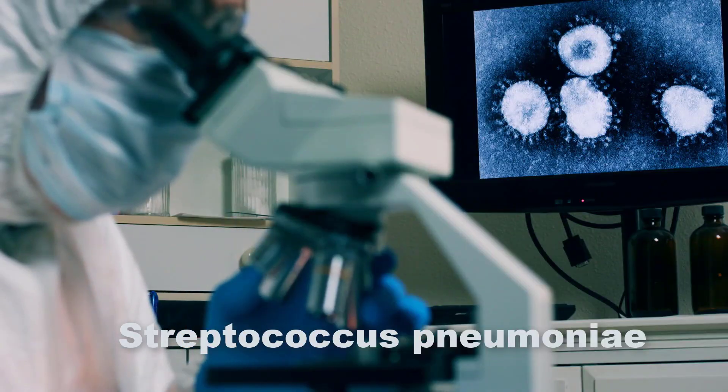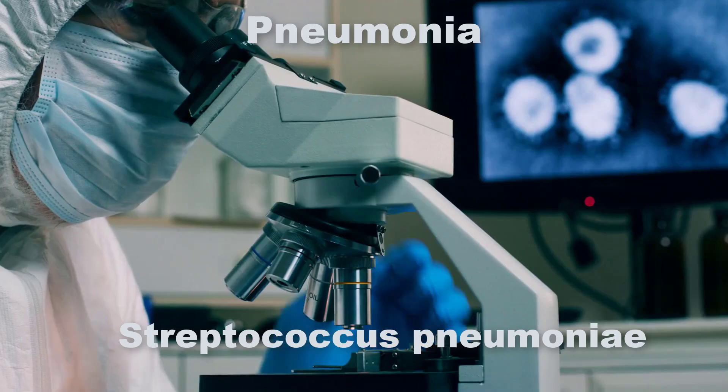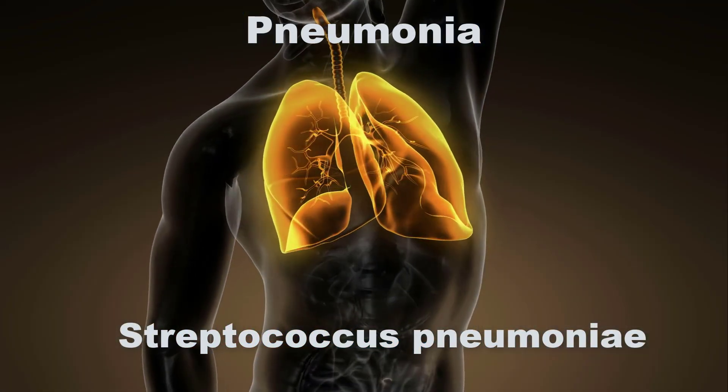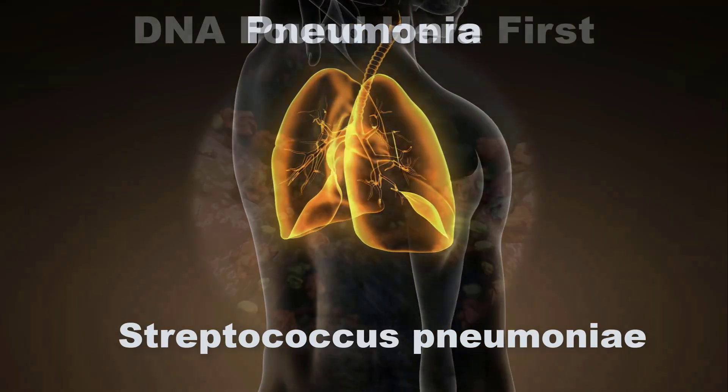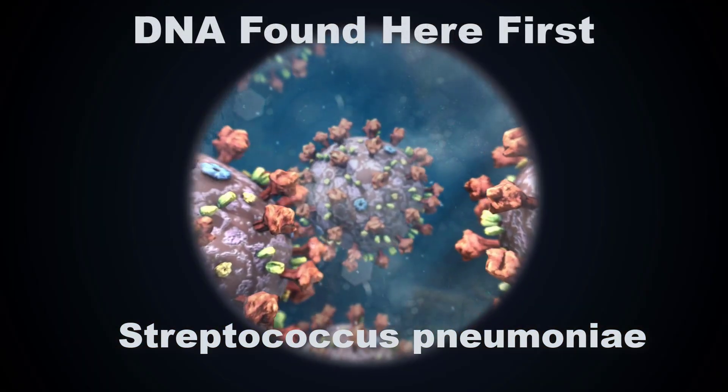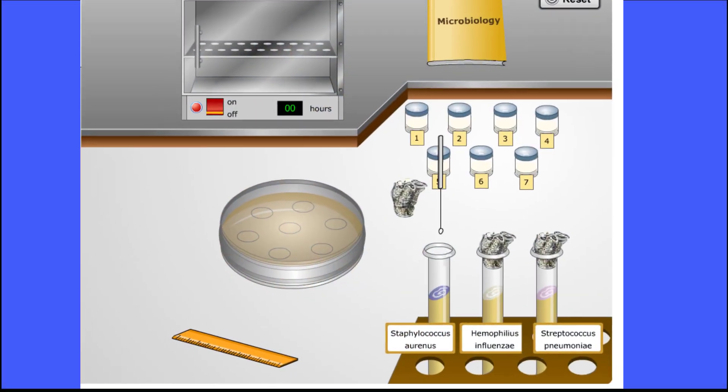Streptococcus pneumoniae causes pneumococcal pneumonia. Streptococcus pneumoniae are spherical cells that are arranged in chains. Interestingly, it was the Streptococcus pneumoniae that was the organism in which DNA was first discovered. Let's start our experiment.